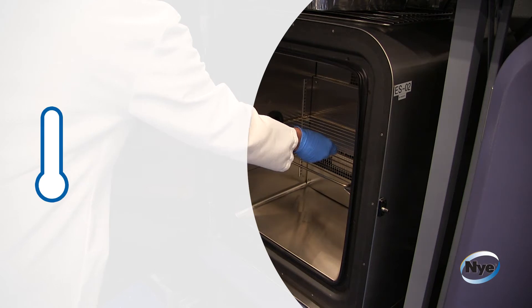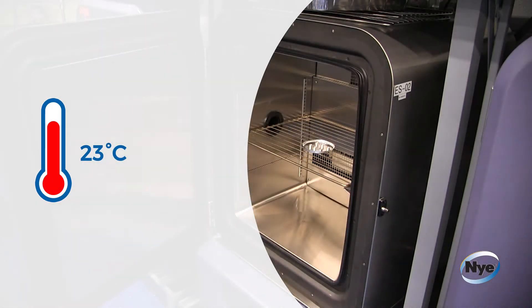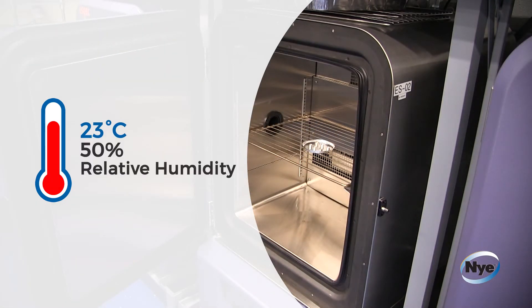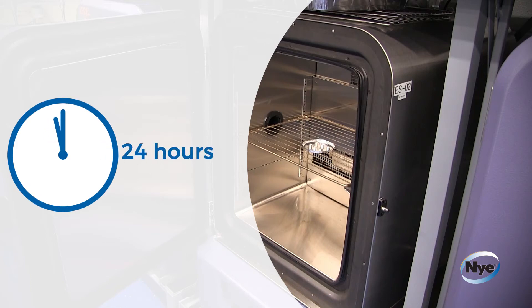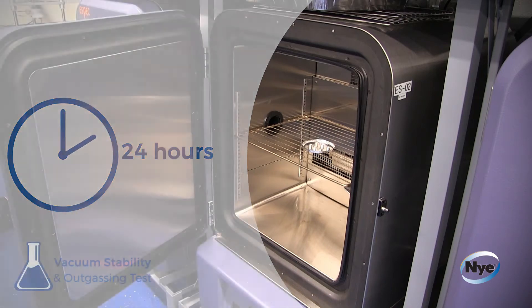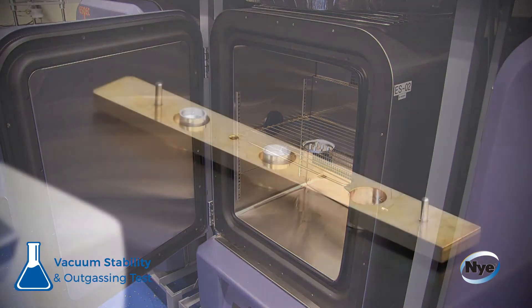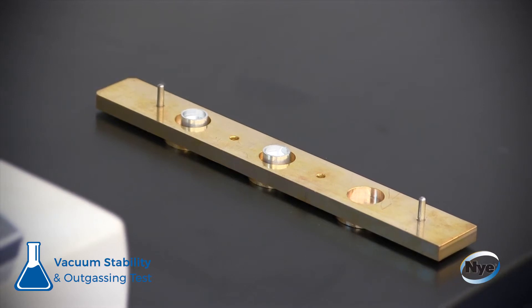In the E595 test, a sample is first exposed to 23 degrees Celsius and 50% relative humidity for 24 hours to condition all of the samples in the same manner. After this conditioning, the samples are re-weighed and put into one of the testing cells.